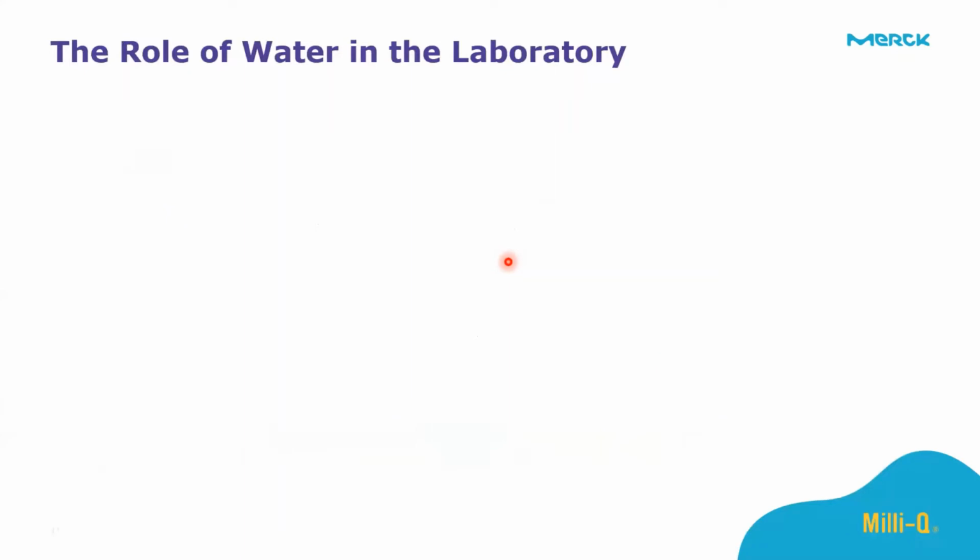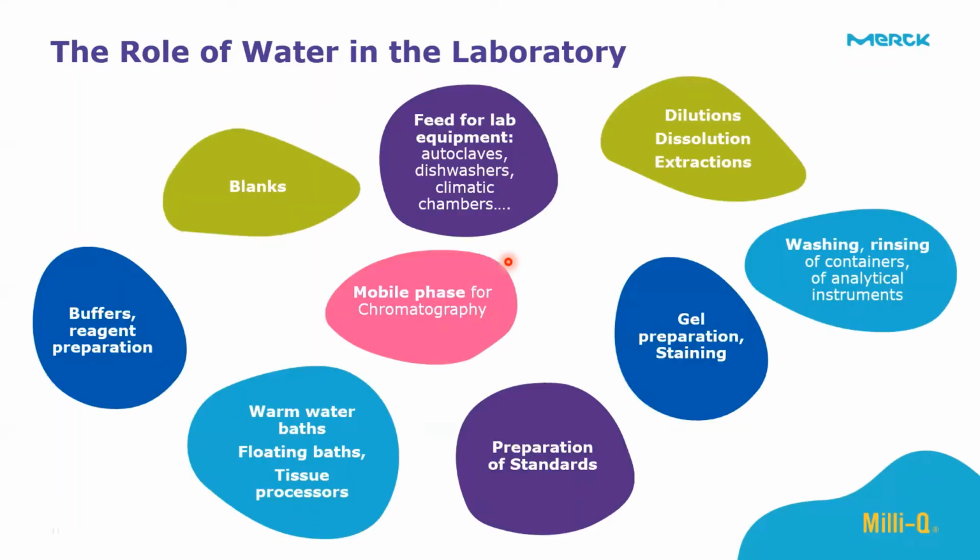So also, I would like us to look at the role of water. We said, of course, that water plays a very critical role in most of the analyses performed in the laboratory, and I just want to highlight a few of those critical roles. One of them, of course, is preparation of blanks that we run before running our products.